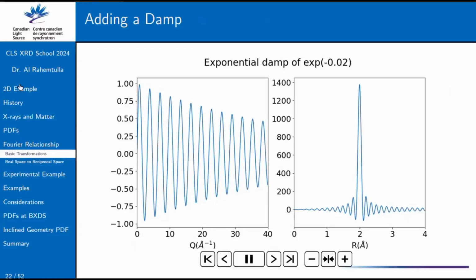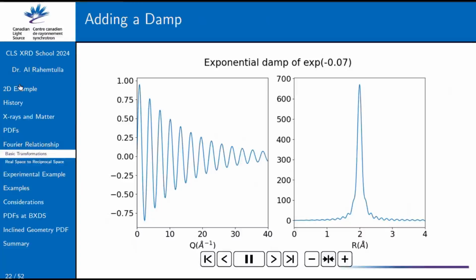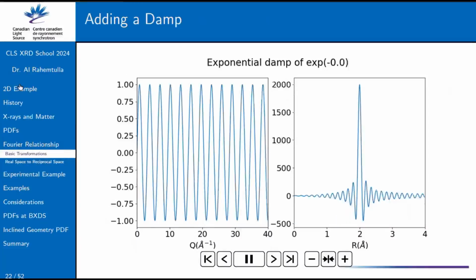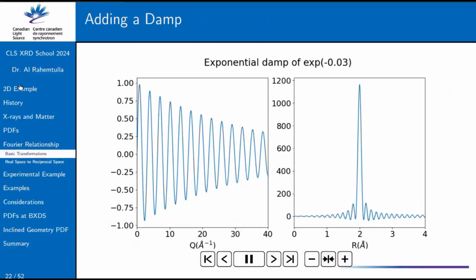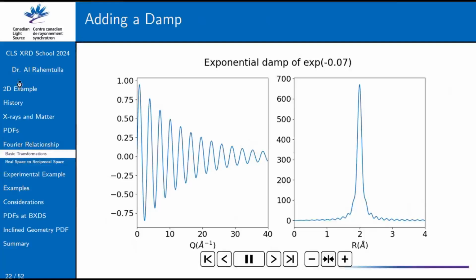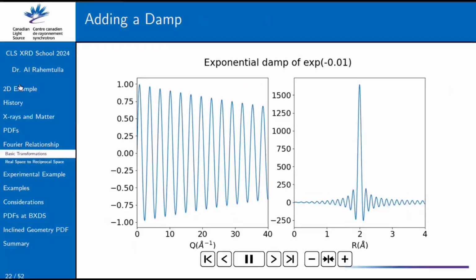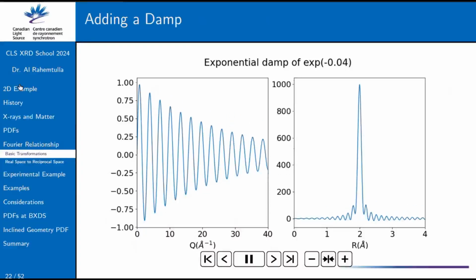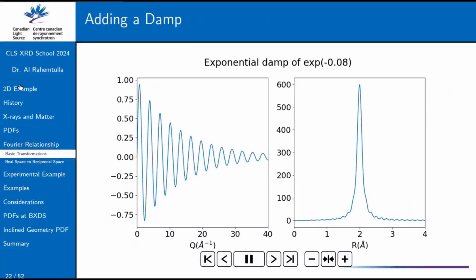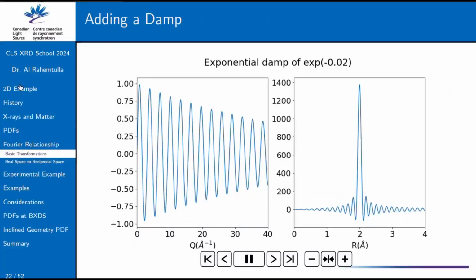Yeah, hi, thank you for the presentation. Could be a dumb question. I'm just wondering what's the highest resolution, or the smallest feature sets, you can observe in the short range structure. Say I have an inorganic metallic sample, there's some elemental distribution. I've seen people do PDF through atomic probe tomography, APT, to see really those one atom and some of its neighbors. Would that be something we can do in the BXDS slide?